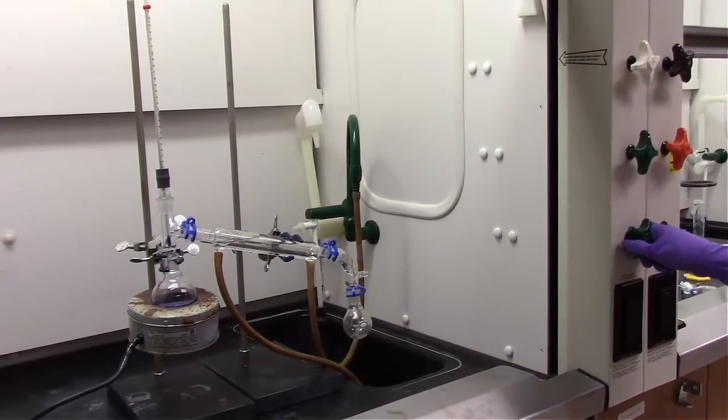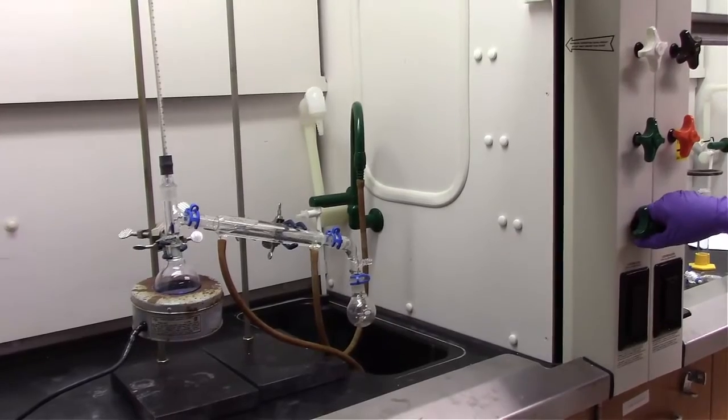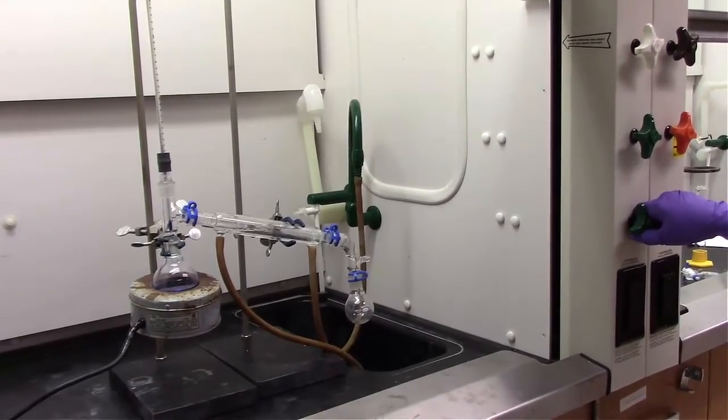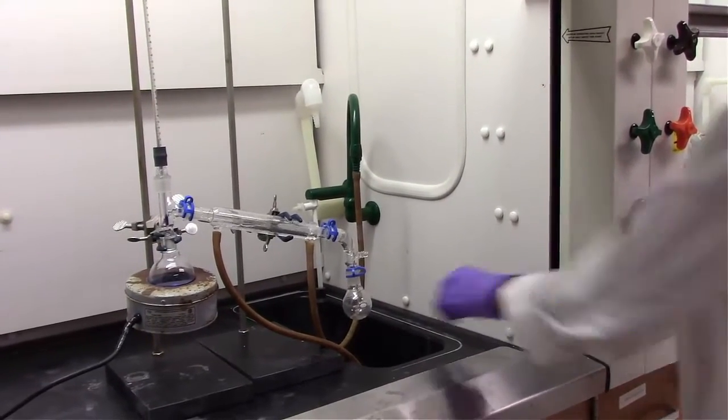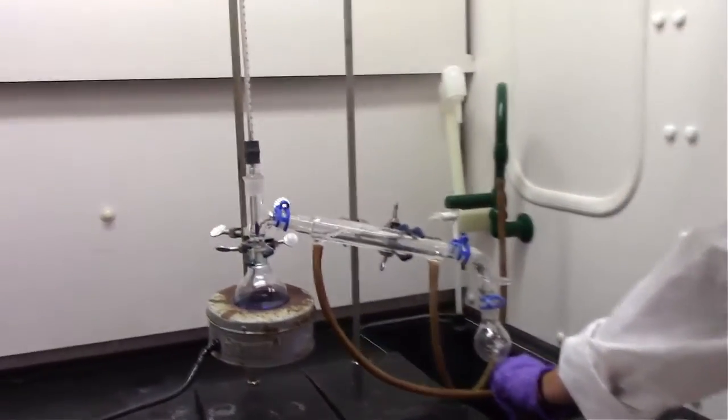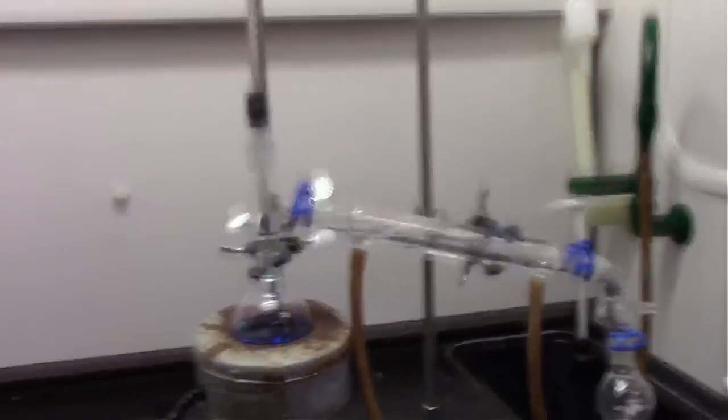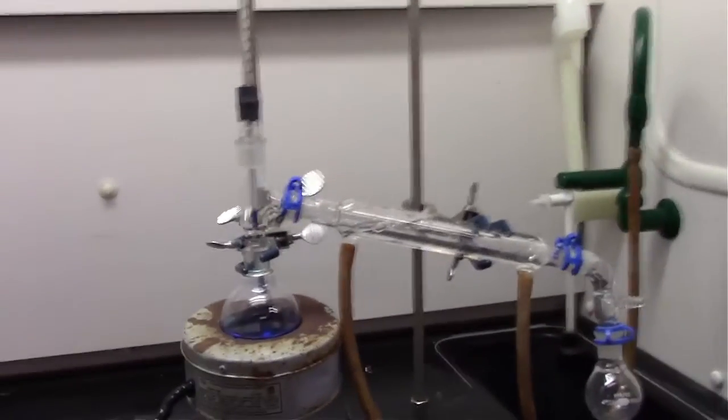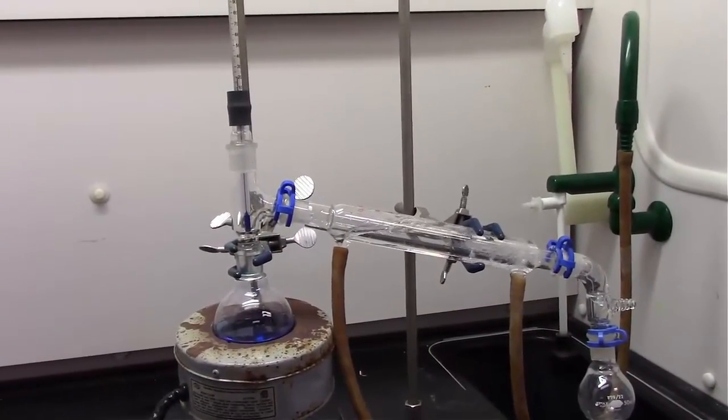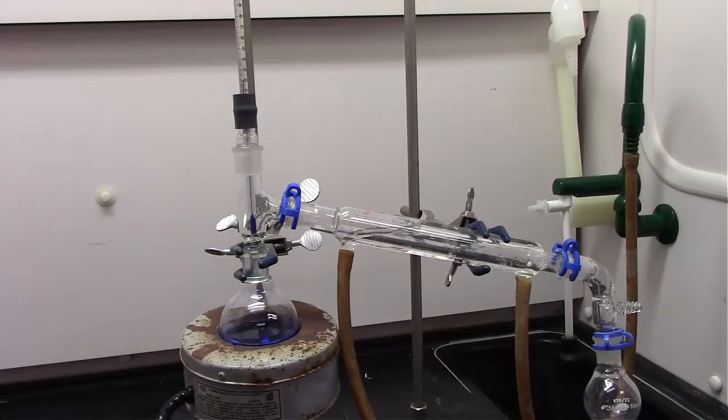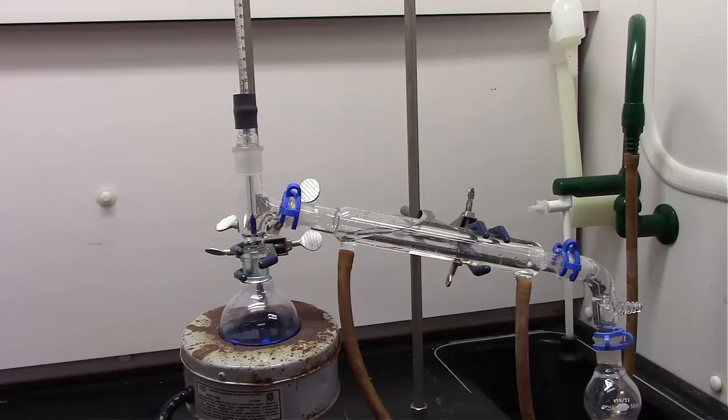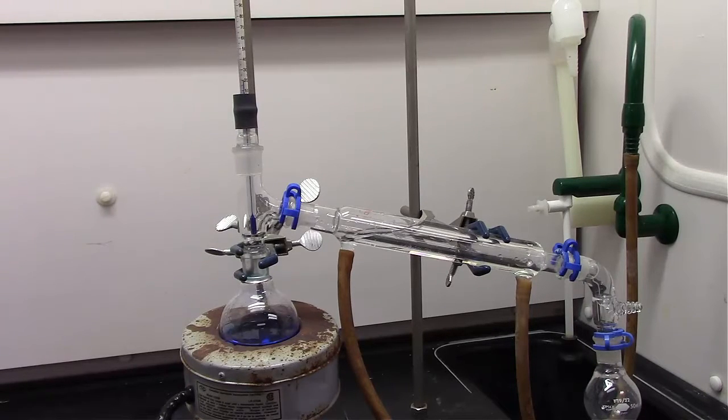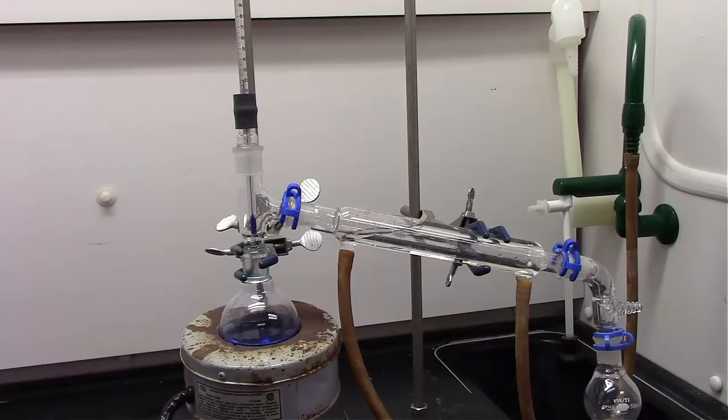The water input always needs to be coming from the bottom, so essentially the part of the condenser that's closest to the sink is where the water is coming in from the faucet, and that water is flowing through the condenser, and then back into the sink through the tube that is closest to the round-bottom flask. And right now, we have the water flowing.